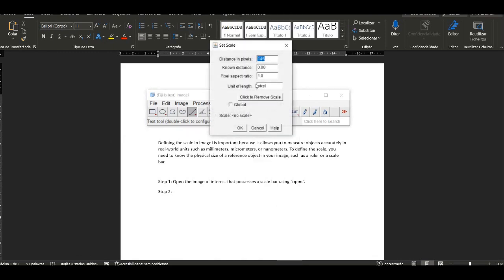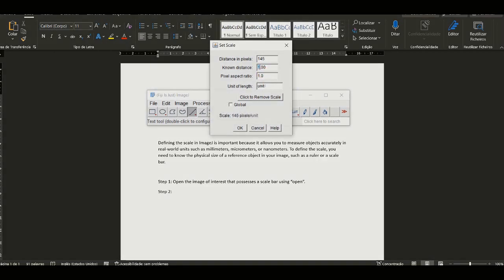And that's it. You now know how to define the scale in ImageJ. I hope you found this tutorial helpful.